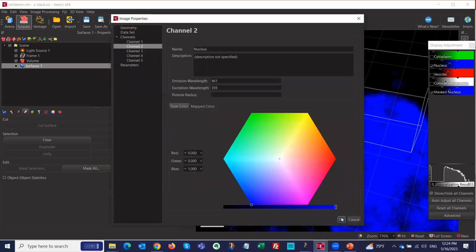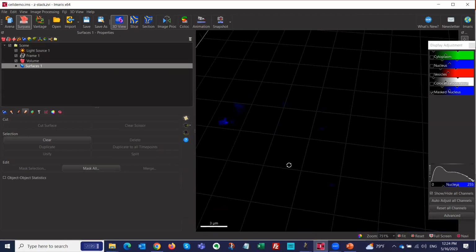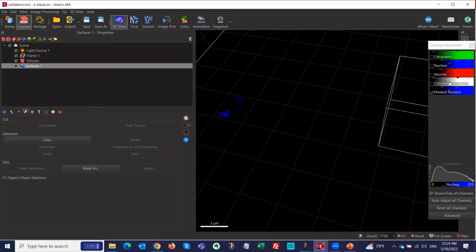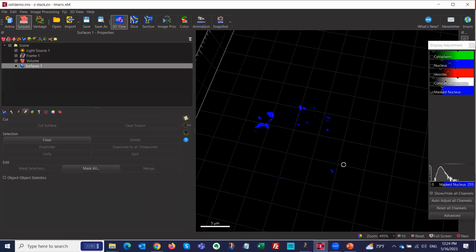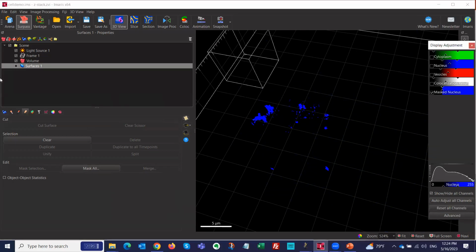Oops, that is only the blue. Right now, you only see the blue inside of my surface, inside basically of the red channel. Okay, like I will increase the intensity to see it. Yeah, so only the blue that's inside in those guys. This is all my blue. This is just blue inside those guys.